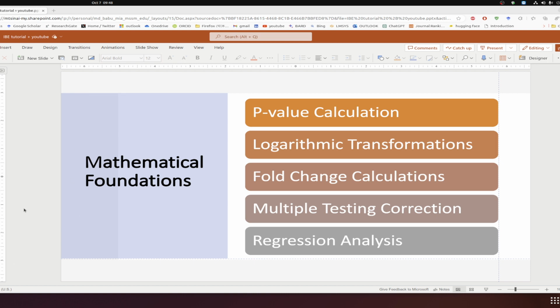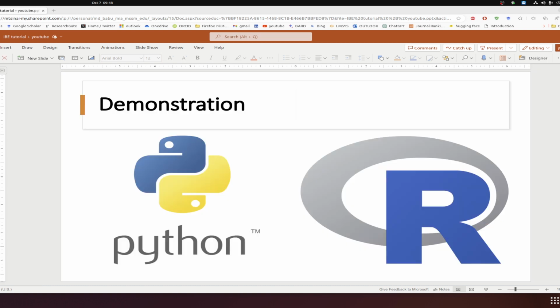So these are the basic foundations for the Volcano plot, which you can go into detailed discussion on later, but now this is the basics. So enough talking, let's go through a live demonstration now. That's where we will be creating some Volcano plots using Python, in a Jupyter Notebook, and in R, in RStudio.